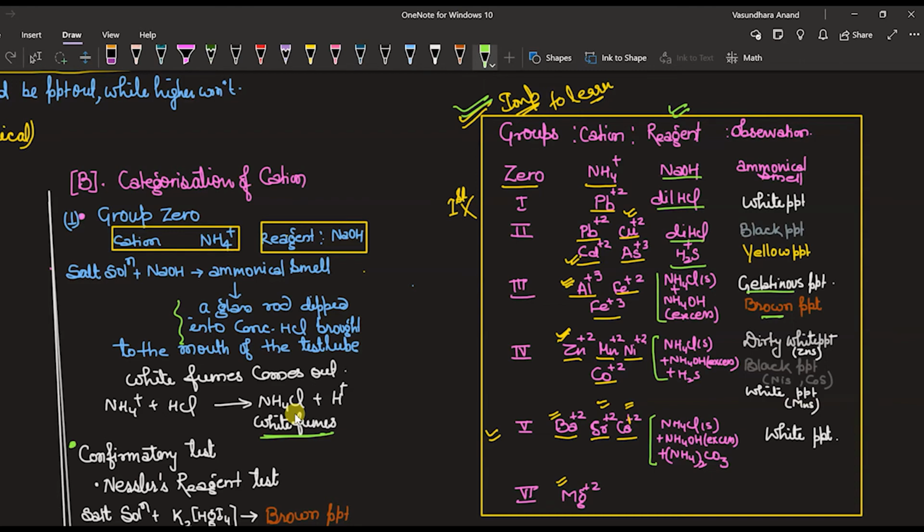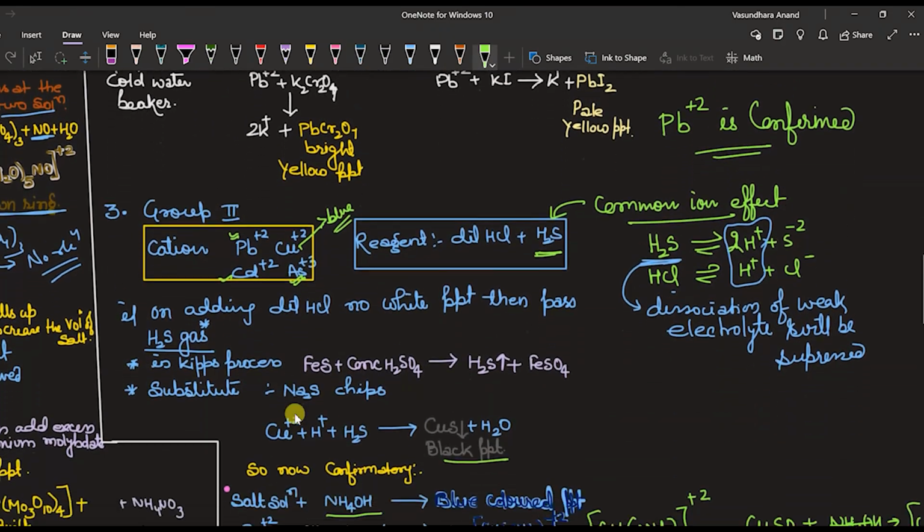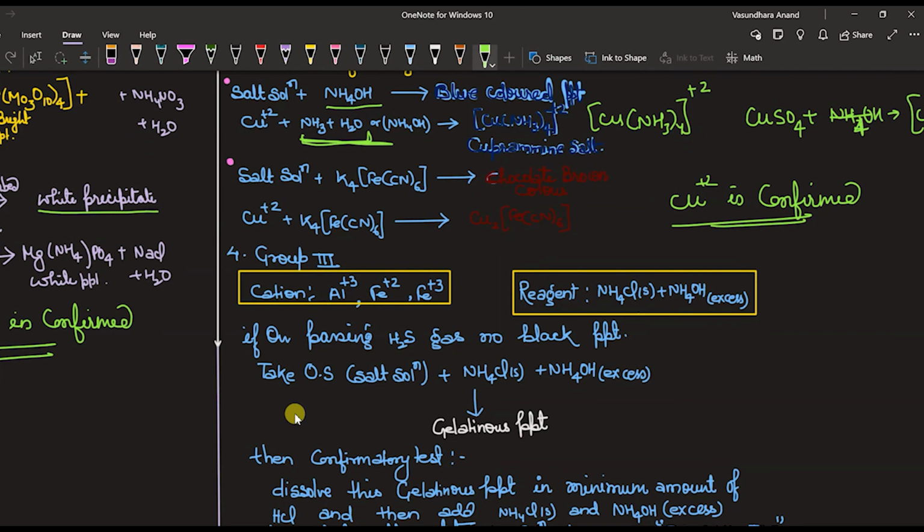Now I am going to tell you that Fe3+ and Fe2+ are colored iron salts, they are brownish in color. Since these salts are colored and not colorless, we don't provide them in the exams. And the color for this we can say is brownish.